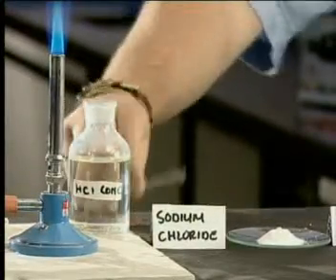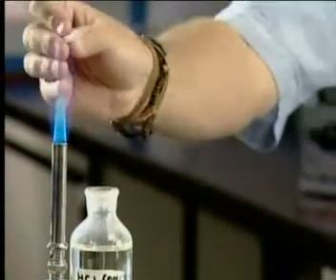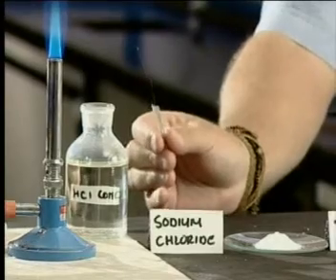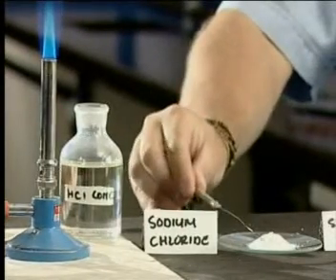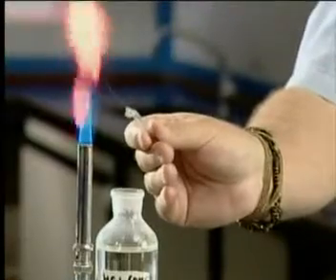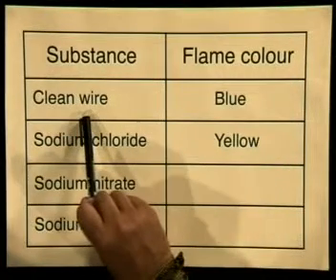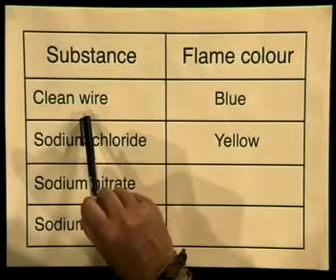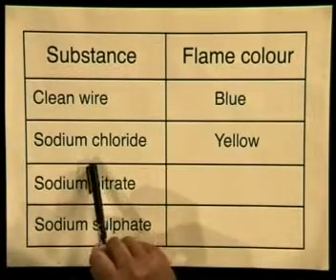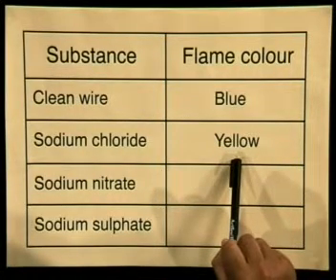I will now perform the flame test by using a small length of nichrome wire. Firstly, I will dip the wire into the acid to clean it, and now place the clean wire in the blue flame of the Bunsen burner. I will now use the wire to place a few crystals of sodium chloride into the flame by dipping the wire into the salt so that the crystals stick to it. Watch what happens when I place the wire back into the flame. When the sodium chloride was placed into the flame, the colour changed to a bright yellow-orange.